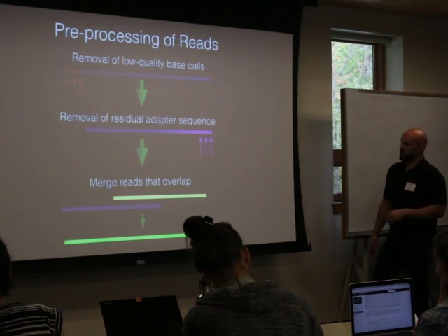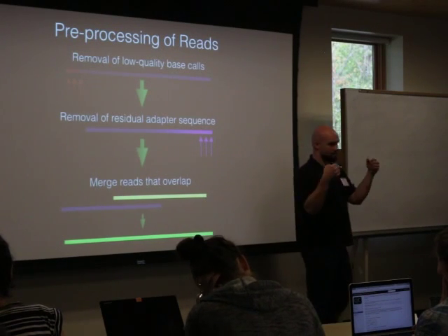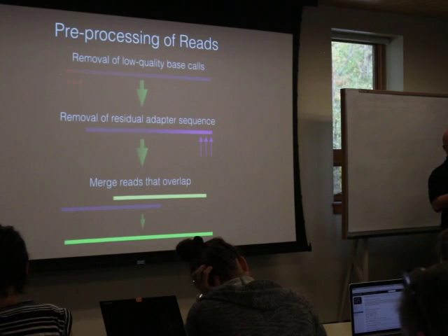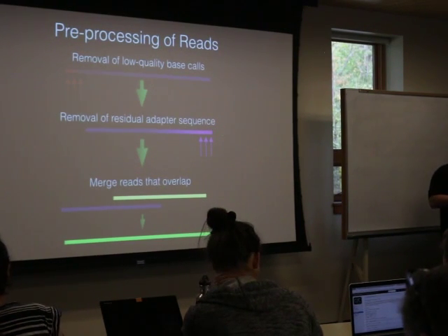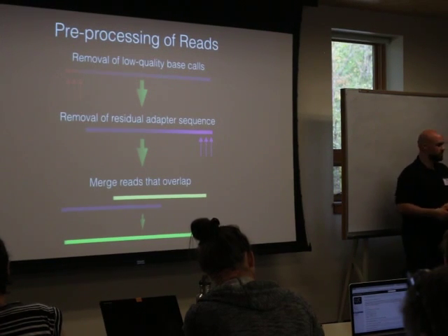And so finally, you can end up with a good series of sequences. Either you've got paired end sequences, or you can basically treat these that are overlapped as single end sequences. Maybe you have paired end sequences, one mate fails, you can still keep the other one and use that as viable information.